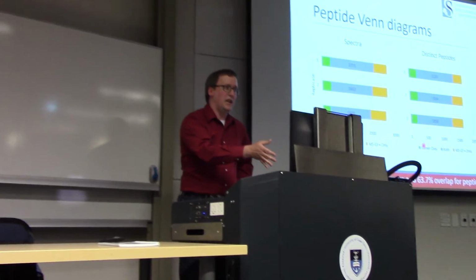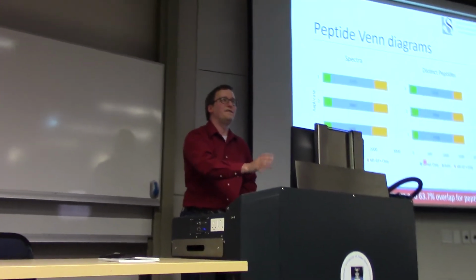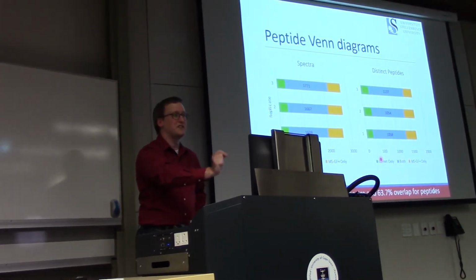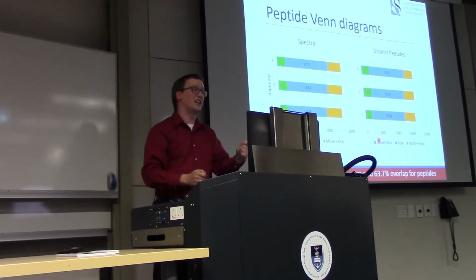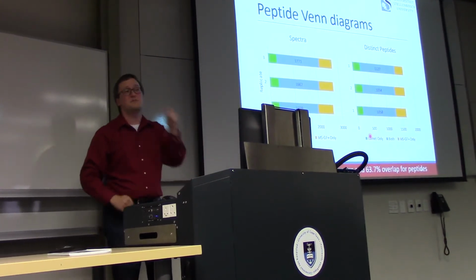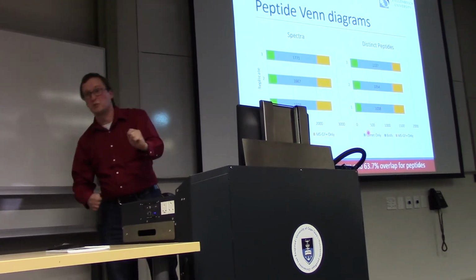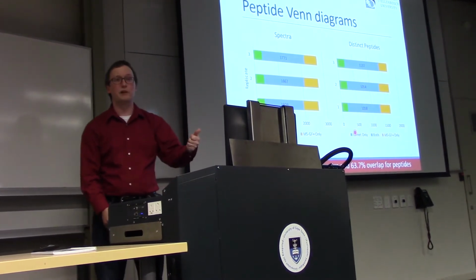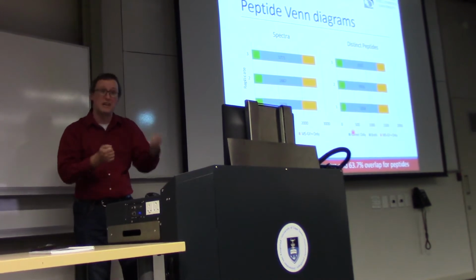What this suggests to me is a lesson that a lot of bioinformaticists over time have failed to recognize. And it's that I'm not that familiar with data of this type. I've spent a lot of time looking at ion trap data. I've spent a lot of time looking at HCD data in QExactives and Orbitrap, stuff like that. I have not spent as much time working in the world of TripleTOF. And so I don't know the optimal parameters. What if 60 ppm was the better setting for precursors? What if the fragment tolerance was way off? These things can make a really big impact in identification.